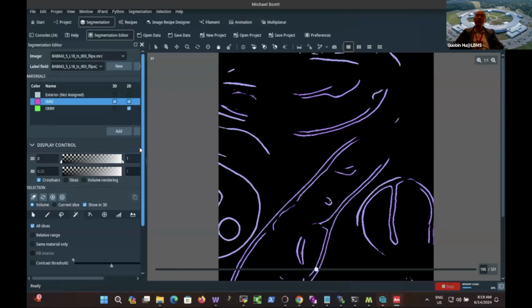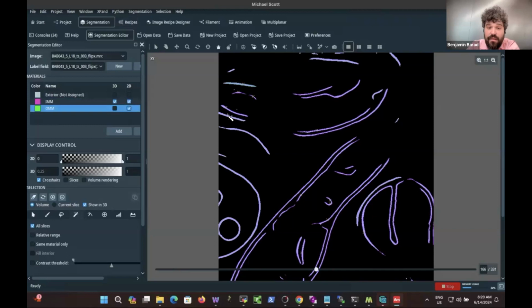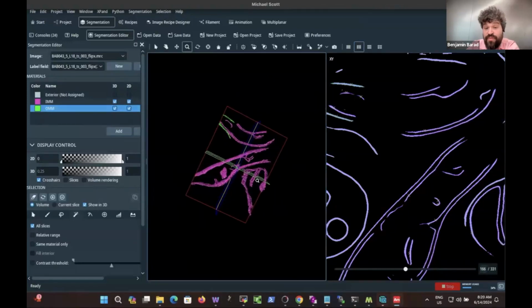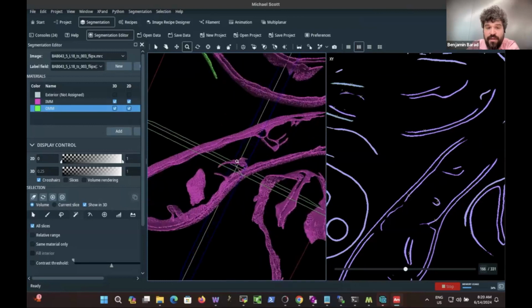That's great. And that's implemented in SerialEM, using the Python interface in SerialEM. But since then, because it works so well and because Fabian did a really good job describing exactly the math to do it, it wasn't new math. It was actually math from a 2000s David Agard paper. Thermo Fisher has also implemented the same beam shift, image shift now in Tomo 5. So you do very similar workflows now in both software packages. And in doing so, you're really able to get access to a lot of data very quickly. Great. The process is not trivial yet, but it's gotten much, much easier to do.